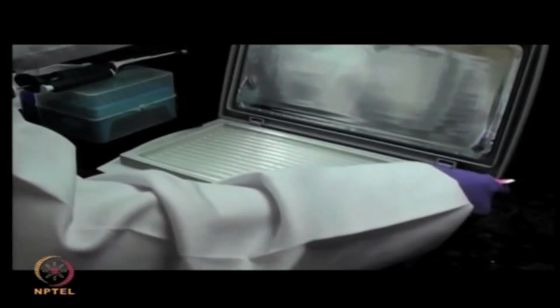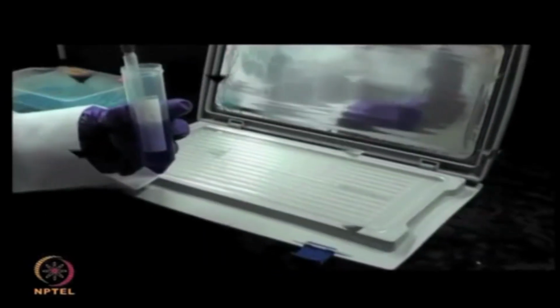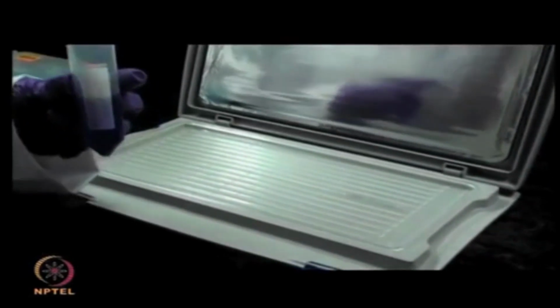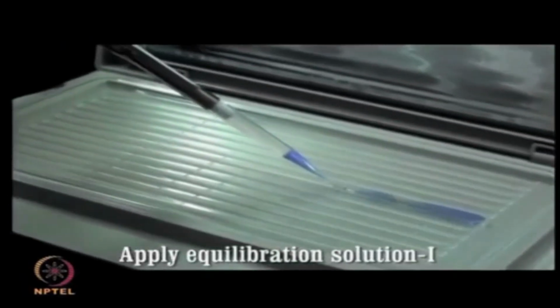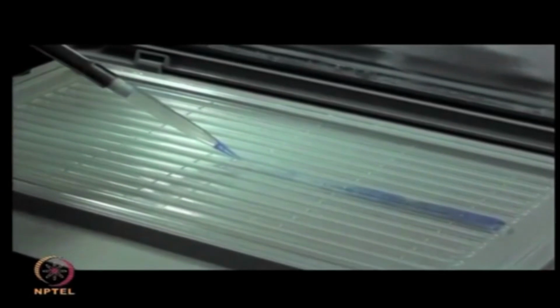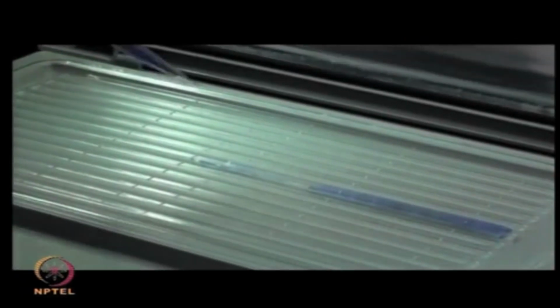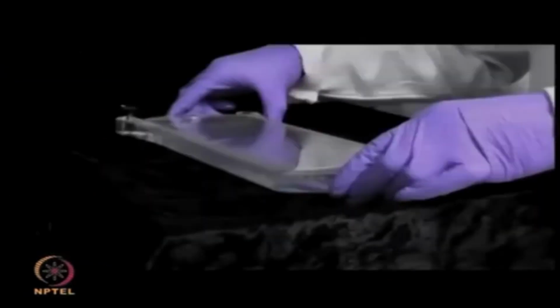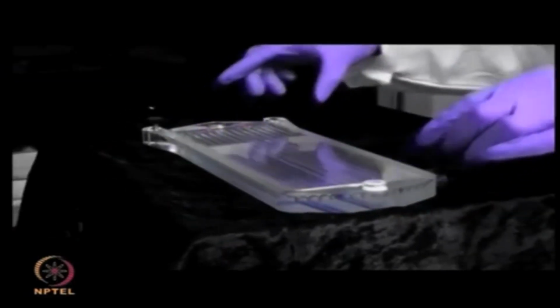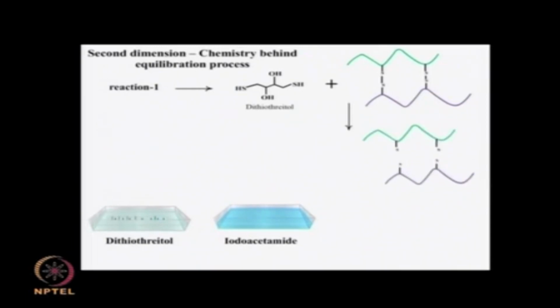Place the thawed IPG strip in the tray, and over it pour the first equilibration solution consisting of urea, Tris-HCl of pH 8.8, glycerol, SDS, bromophenol blue along with dithiothreitol or DTT. Place the assembly on a mechanical shaker for 10 minutes. The dithiothreitol enables cleavage of all disulfide bonds present in the proteins on the IPG strip.